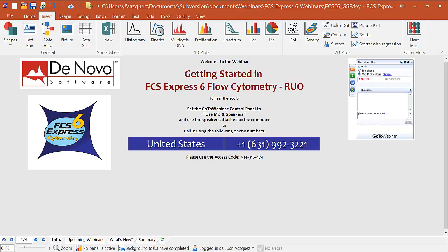Okay. Within the software, as I mentioned, we do have a lot of features. We have the ability to use spreadsheets. We can export directly to PowerPoint, to PDF. We can create images. We can also integrate spreadsheets, where the spreadsheets have a lot of the same functionality as Microsoft Excel.